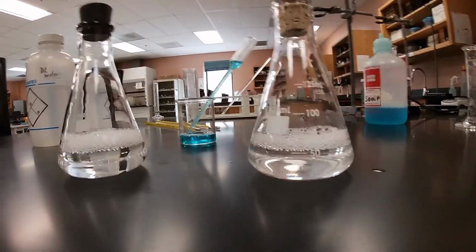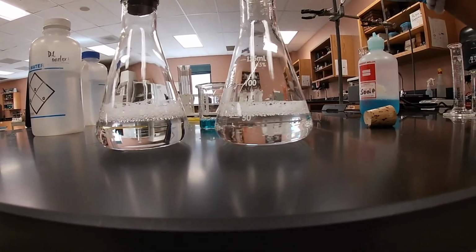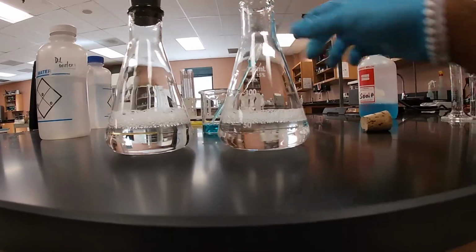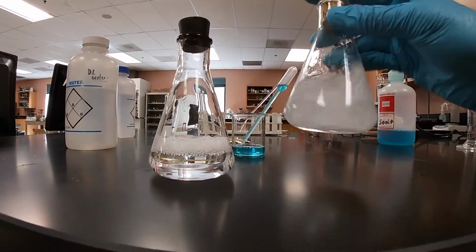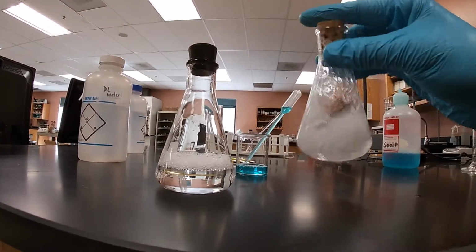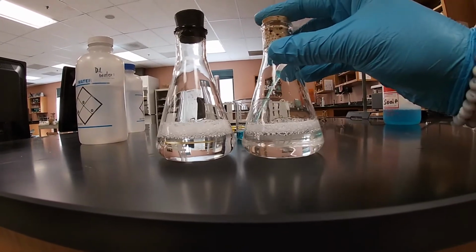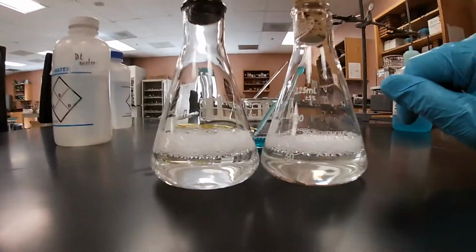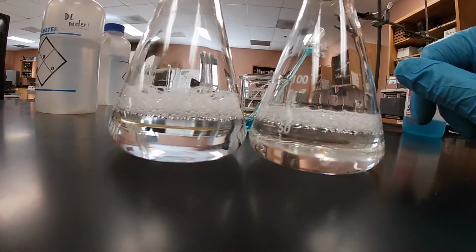And so we'll go ahead and add another drop. As we add another drop of soap, we're gonna go ahead and shake for 10 seconds. 1, 2, 3, 4. And see if the amount of suds is about the same. And as you can see, they're not. So we'll go ahead and add another drop.